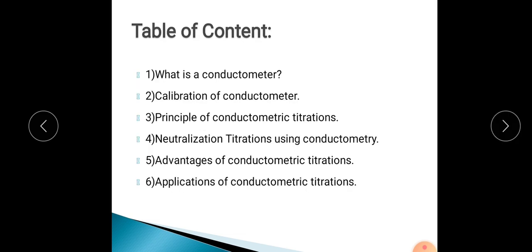What content are we going to cover in this session? The list is mentioned here. What is a conductometer? Calibration of conductometer, principle of conductometric titrations, neutralization titrations using conductometry, advantages of conductometric titrations, and applications of conductometric titrations. So in this video we are going to cover these 6 things. So this is today's content.